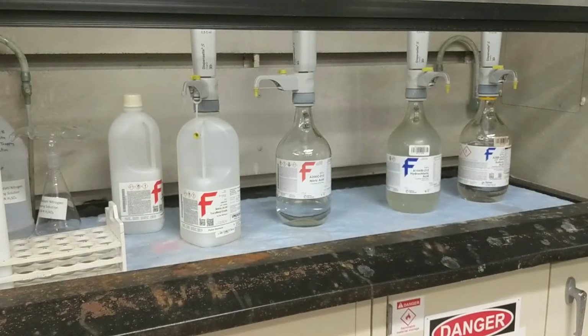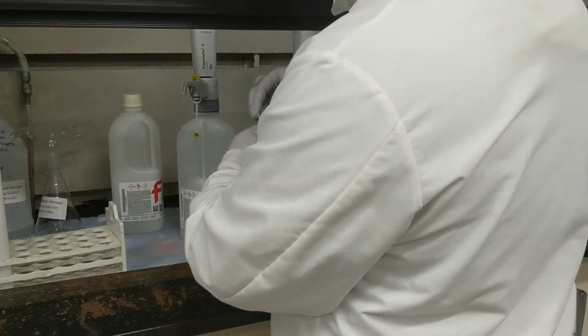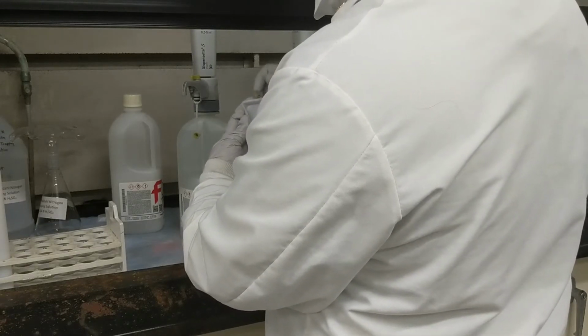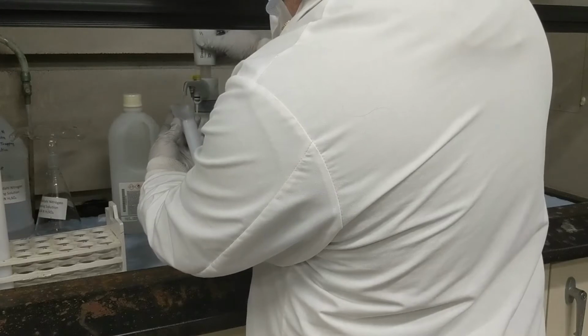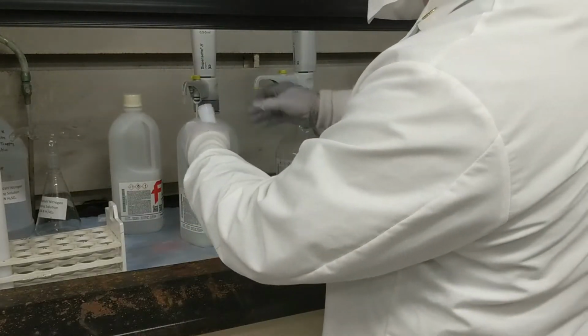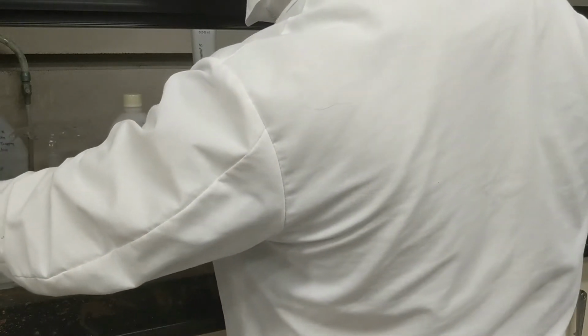You can see I forgot to actually put the sample in this time. I was about to put the acid in before the sample. But so, sample goes in from our weigh boat, tapping to make sure that I can get as much of the solid in. And then now I rinse down the weigh boat with 5 milliliters of the nitric acid to make sure I got as much of the sample out of the weigh boat and into the tube. And to that, I add another 5 milliliters of our nitric acid. So that's the standard one.